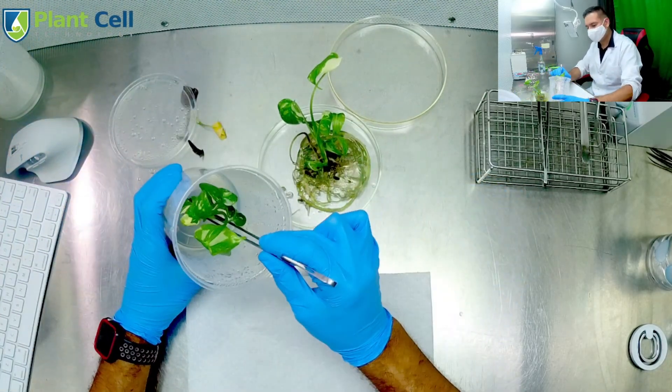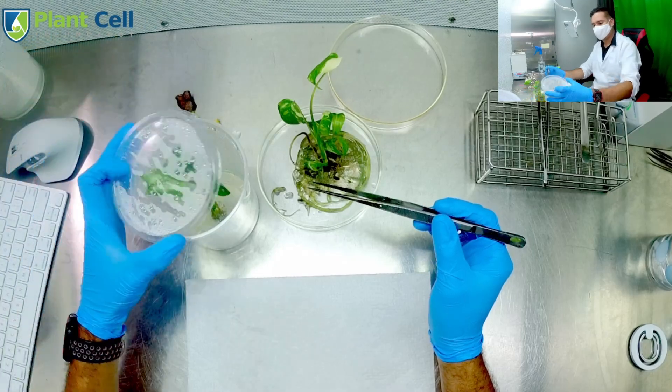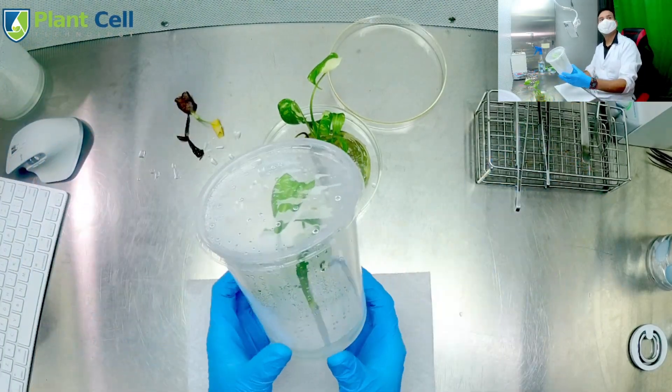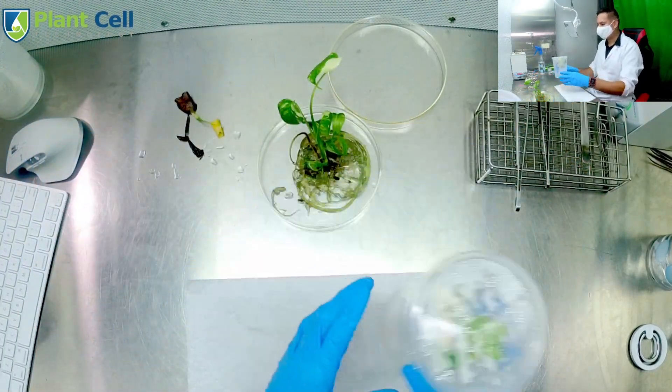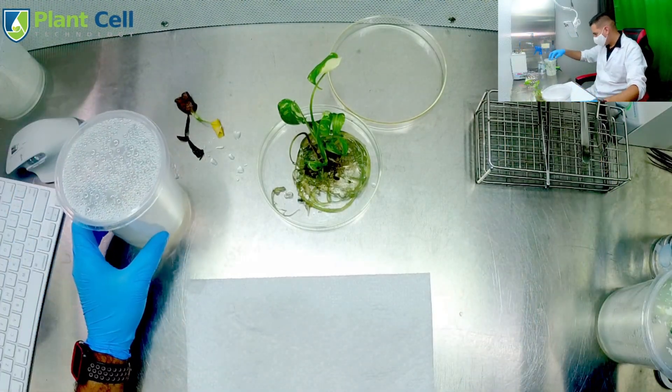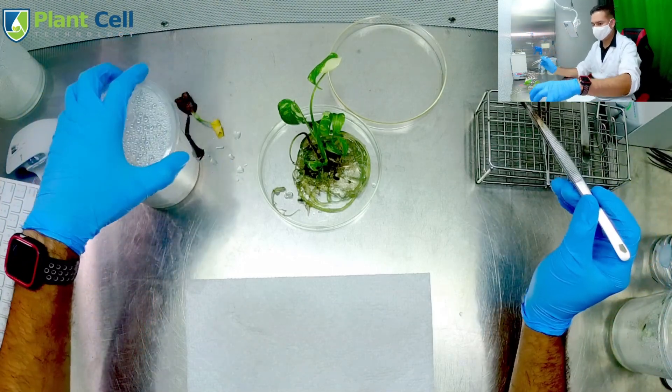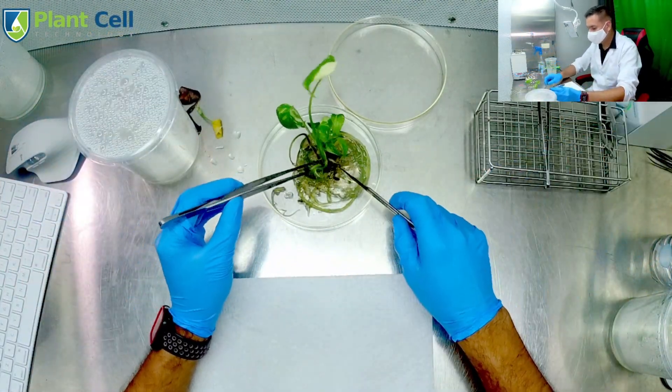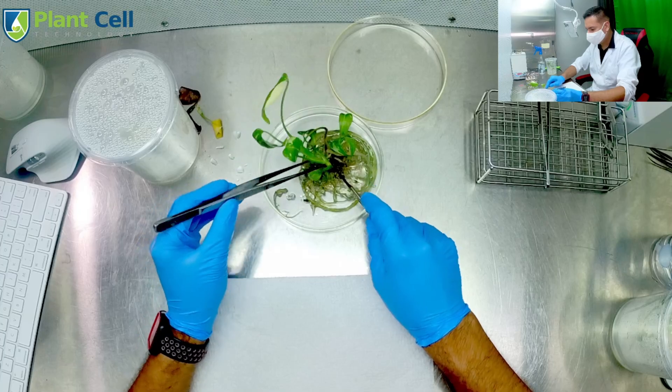The biggest two plants are going to the same media. However, the next two smaller plants are going to different media. This media has 3 milligrams per liter of BA and that's it - there is no IBA for this media. So it is MS medium, 30 grams of sugar, and 3 milligrams per liter of BA.